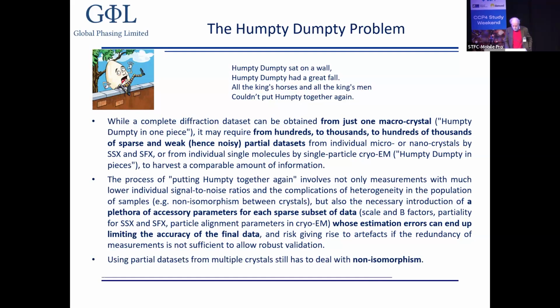Developments have expanded enormously into this region of serial methods on microcrystals, microcrystallography, multi-crystal data collection. And of course, sometimes they are necessary, but you can't beat, that's the hunch, you can't beat what you would get from a bigger crystal.